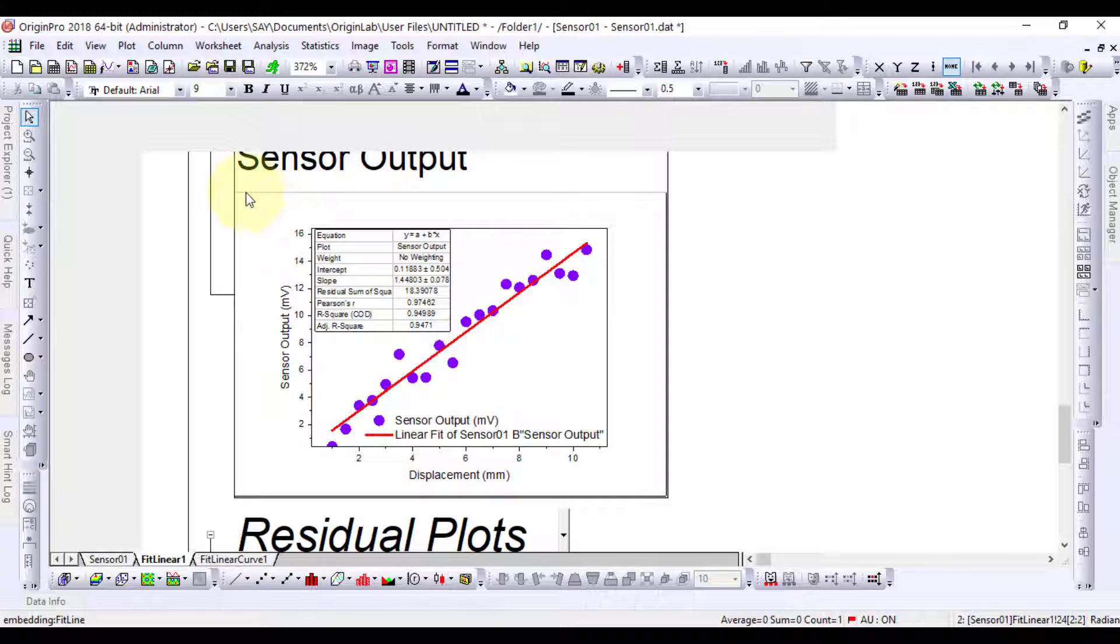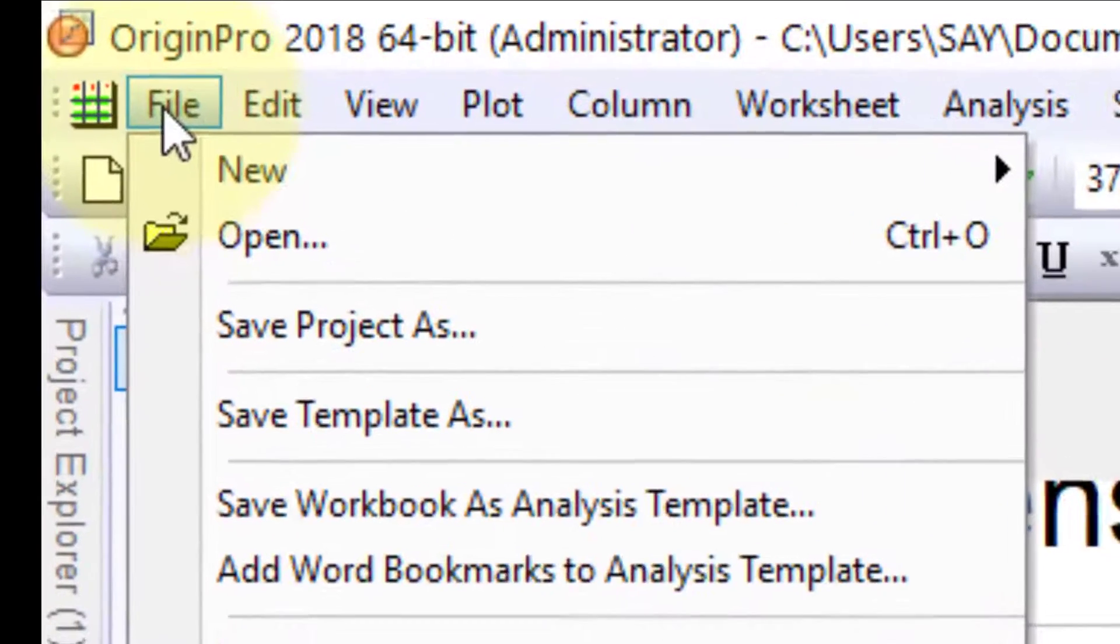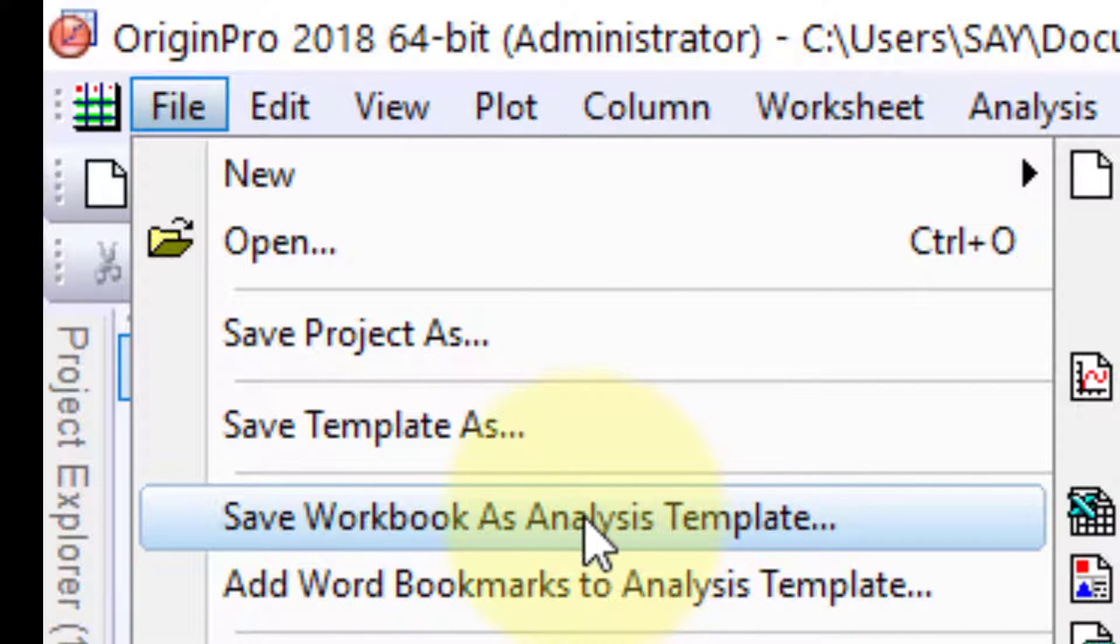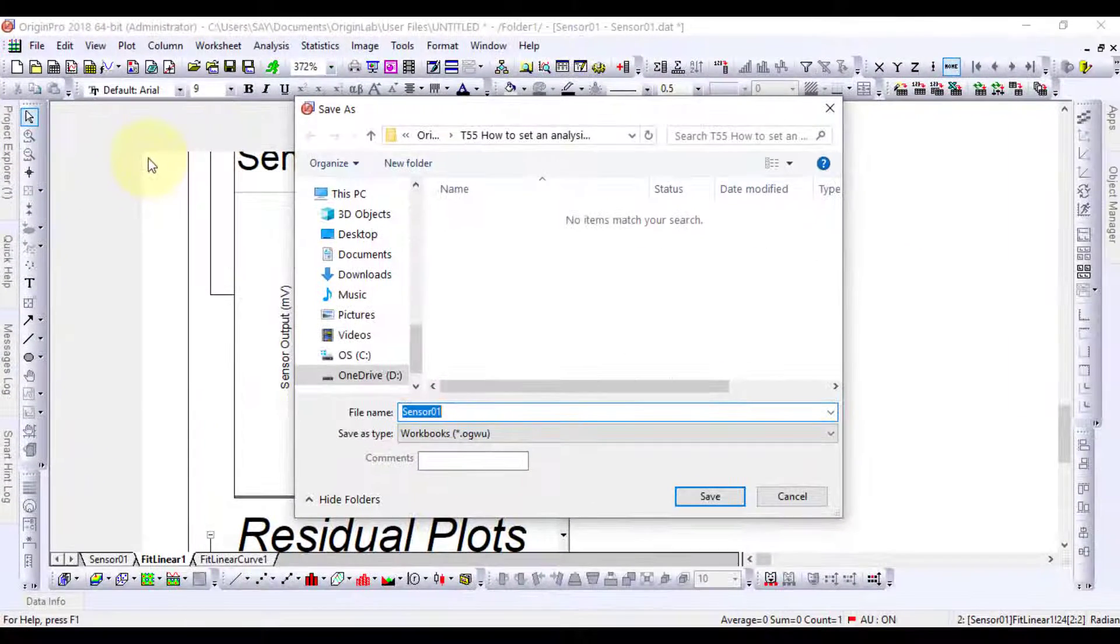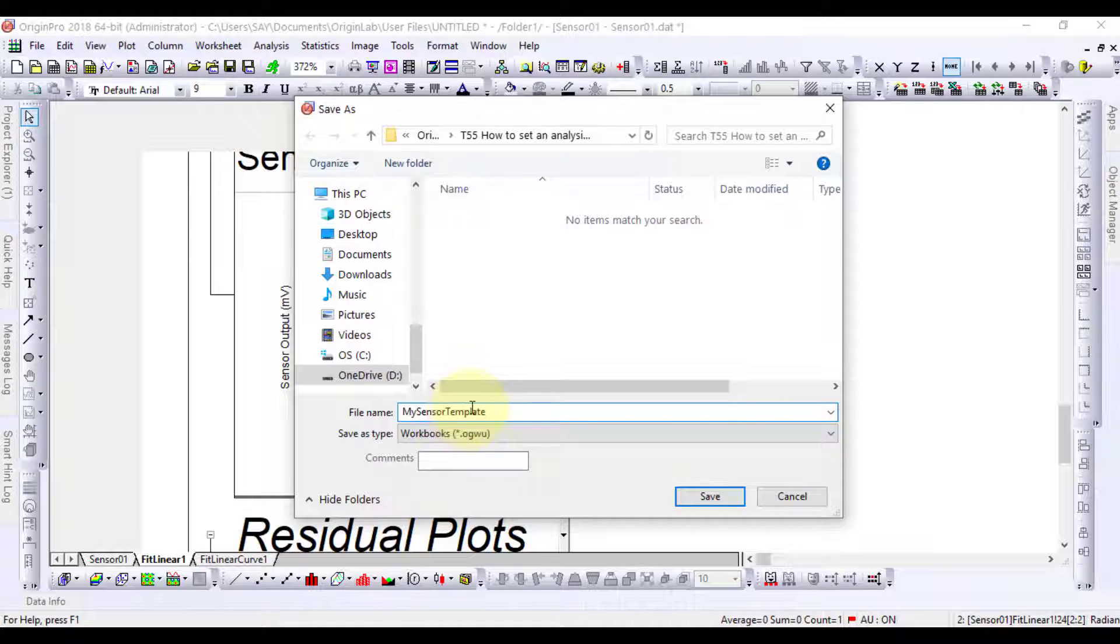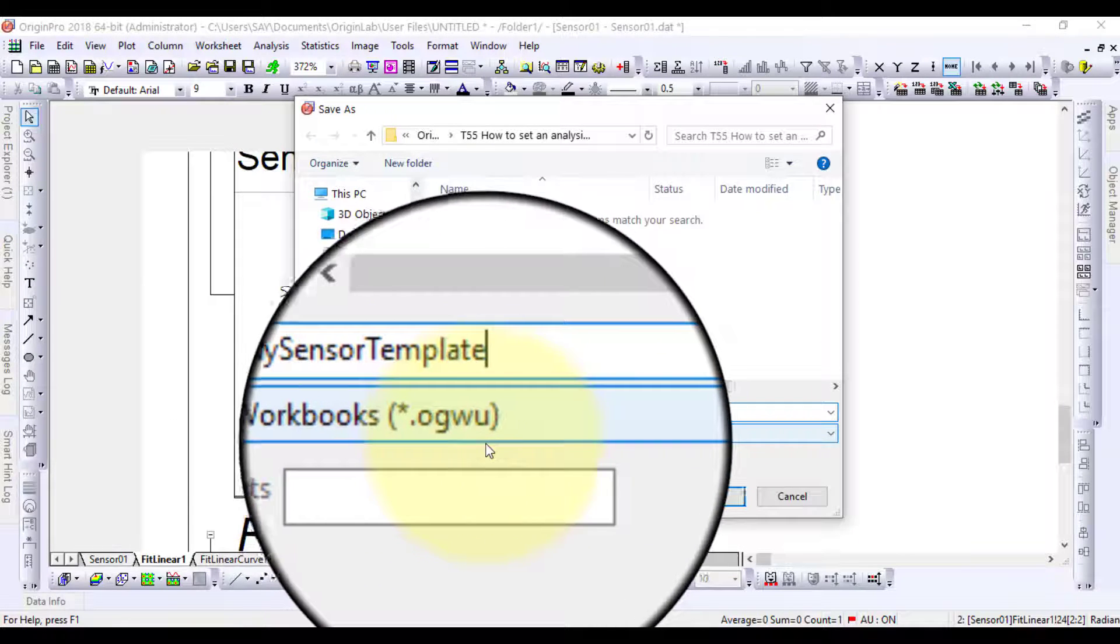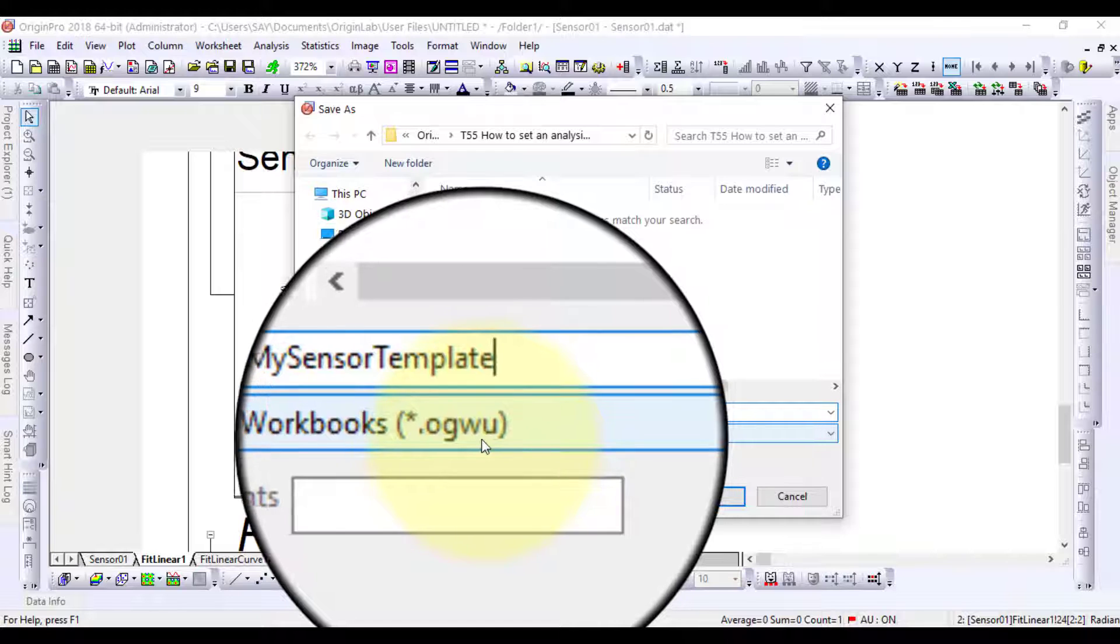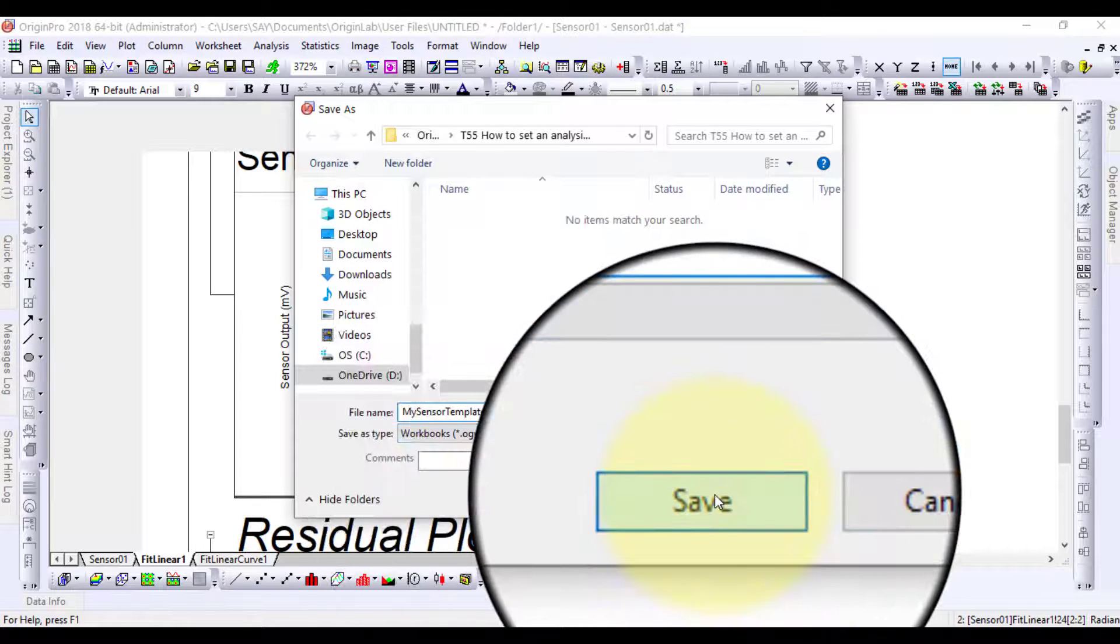It is now ready and we can save it as an analysis template at our desired location. Here, the extension of the file is .ogwu, which is for an analysis template.